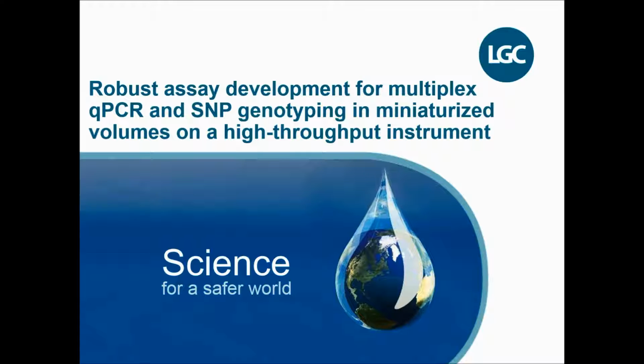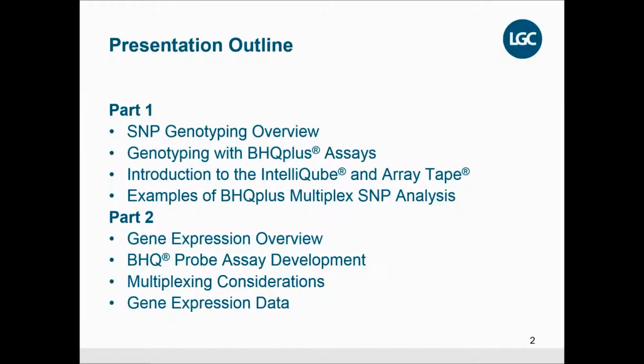The title of my presentation is Robust Assay Development for Multiplex qPCR and SNP Genotyping in Miniaturized Volumes on a High-Throughput Instrument.